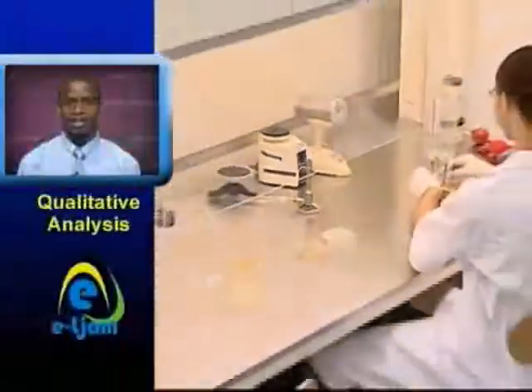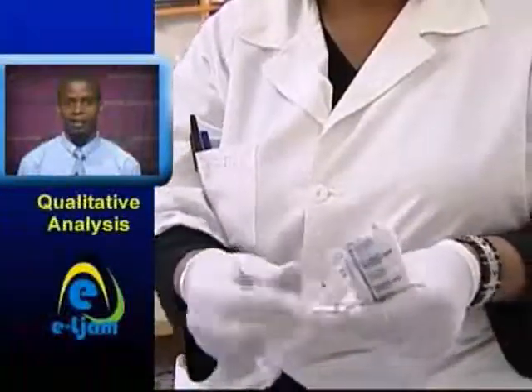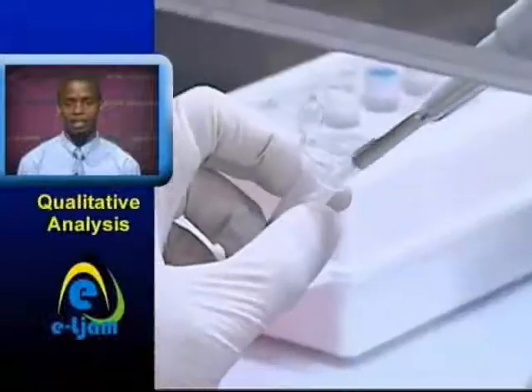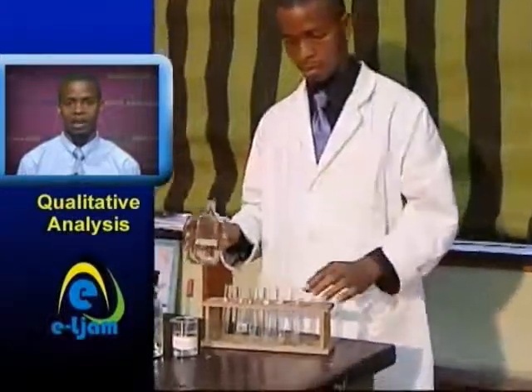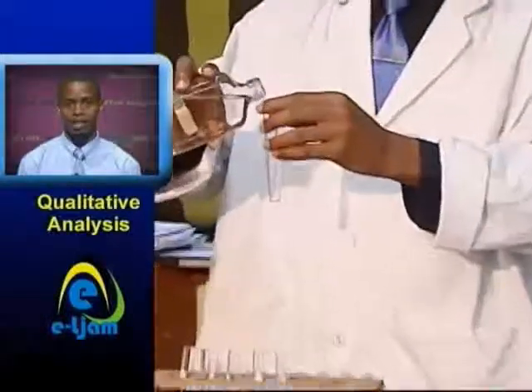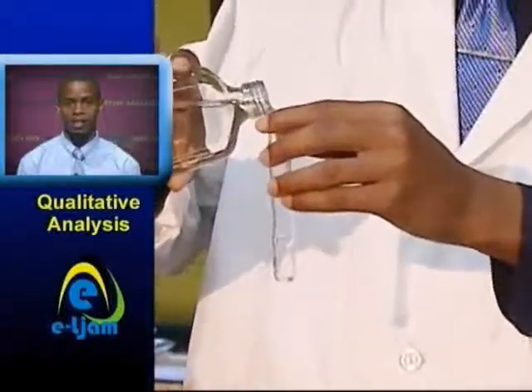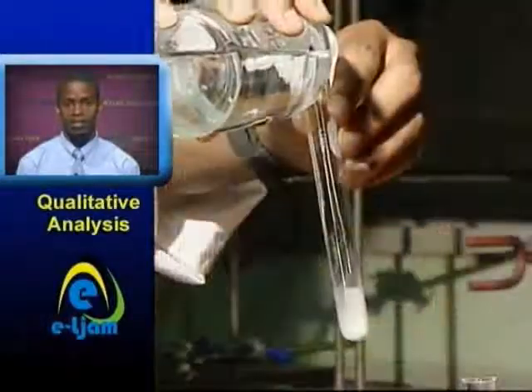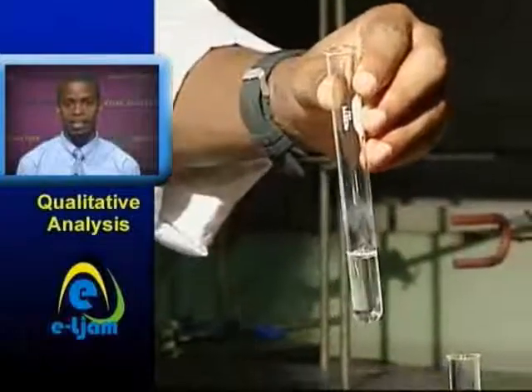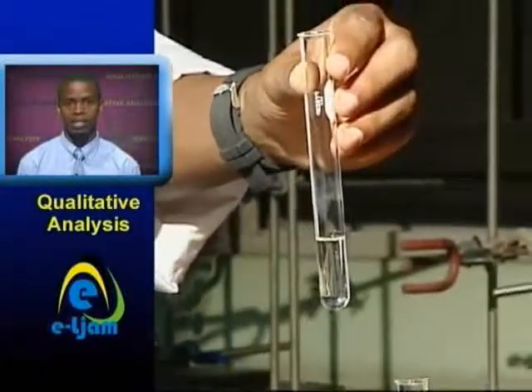In chemistry, we often analyze samples of materials to determine their properties and composition. These analyses may be quantitative or qualitative in nature. While quantitative analysis measures how much of a substance there is, qualitative analysis establishes what that substance is. This video outlines the techniques involved in elementary qualitative analysis and the chemistry that underpins it.